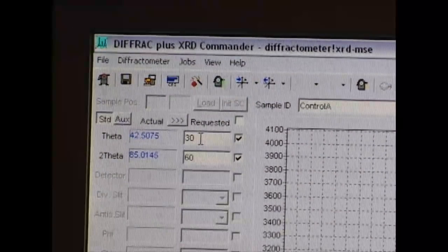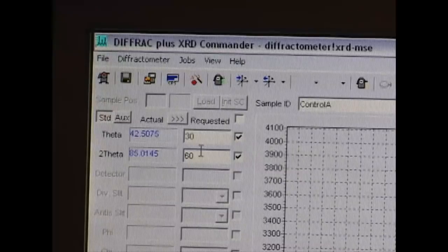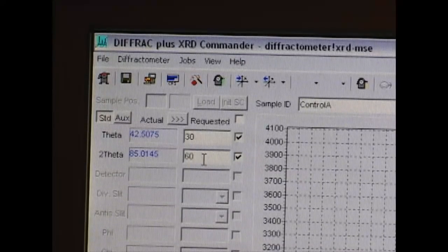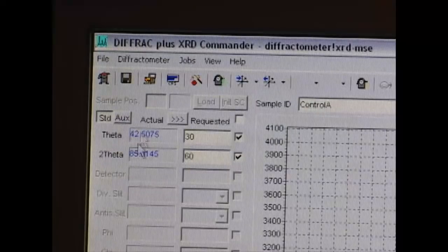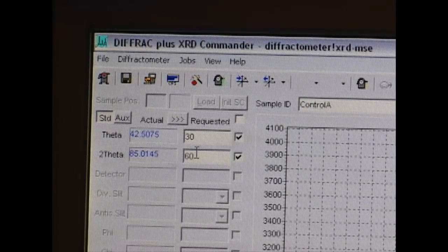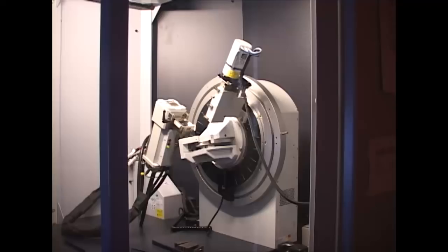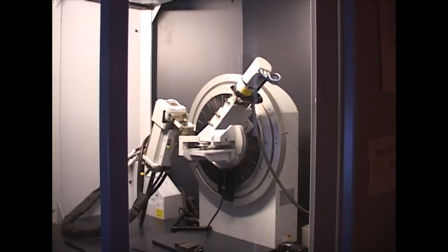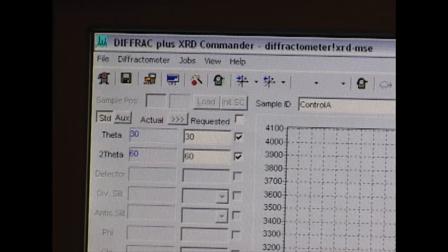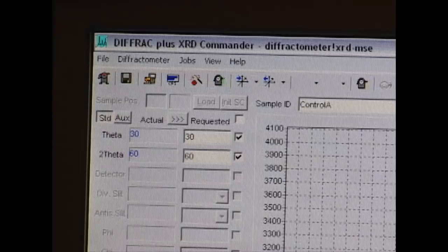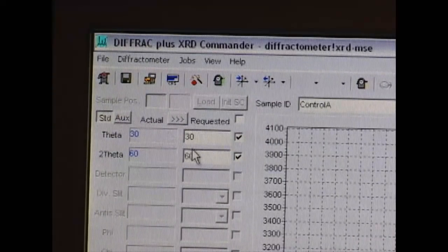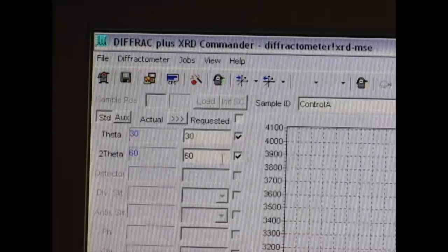Up here, we have another place where you can actually change the positions of the detector and the sample. Right now, the blue, just like with the power, the blue is the current status of the position and the black over here is where you want to change it to. Right now, it's at 42 and 85 and I'm going to change it to 30 and 60. And there's a little icon up here that says move drives. Just press that and the drives will move to that position. This is not necessary to do to run your scan. When you hit the start button, it's just going to go to wherever value you have in here. But it is convenient to be able to move the detector and the sample exchanger if it's at a weird angle to start with.